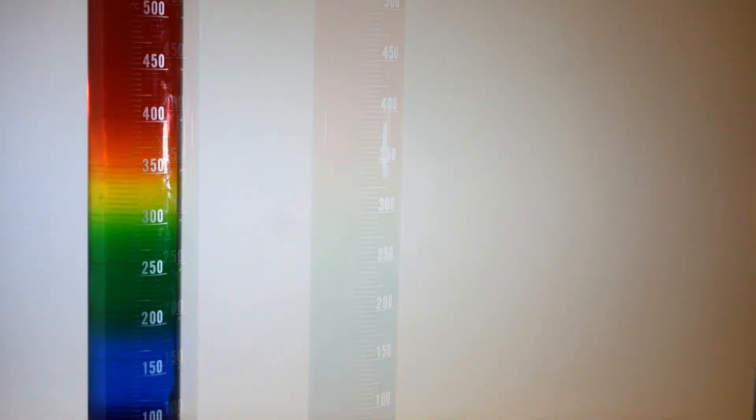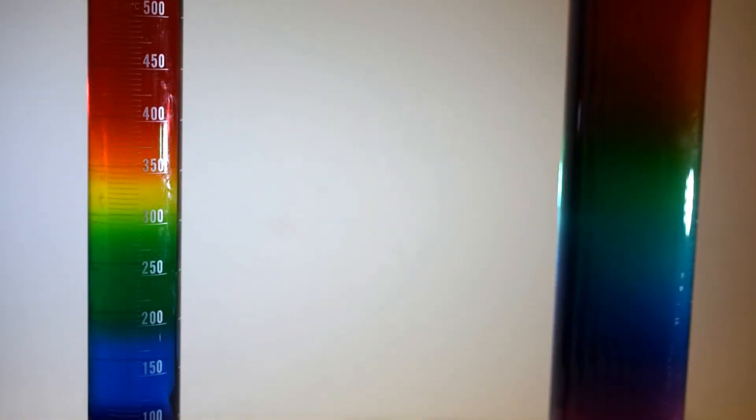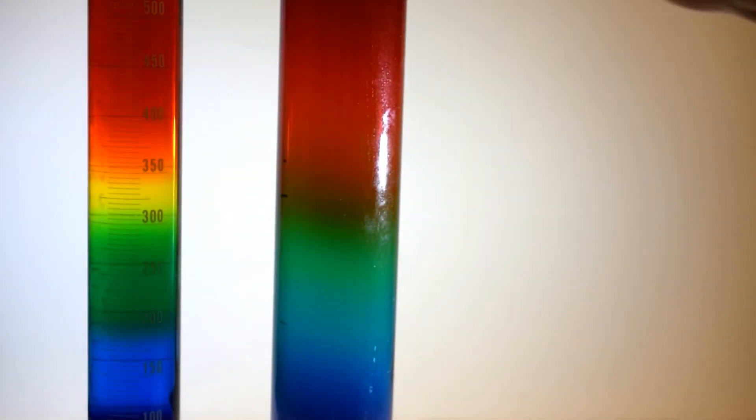You can also prepare the column in a larger graduated cylinder. This one on the right is one litre. It's about six weeks old and the colours are beginning to merge.